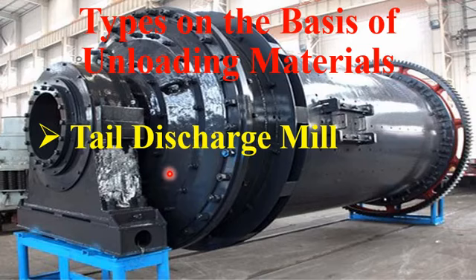Okay, from the head the material is incorporated from the inlet and discharged from the outlet or from the tail. So basically, in simple words, dear student, the tail discharge ball mill is based on head and tail.